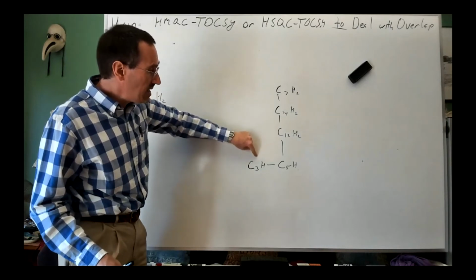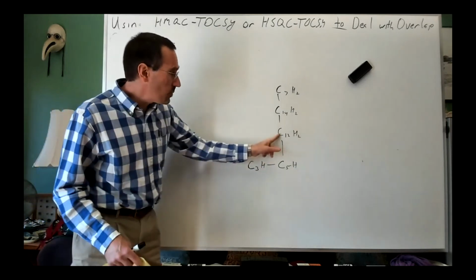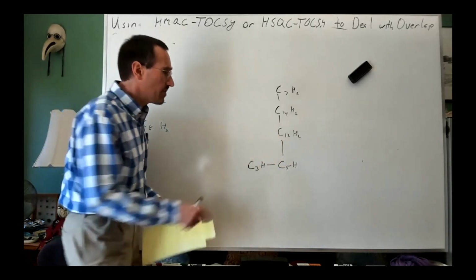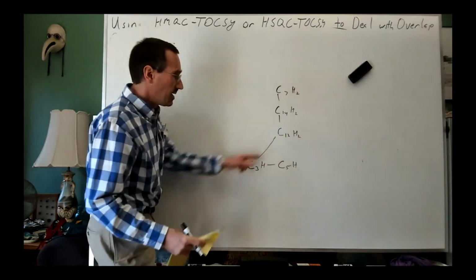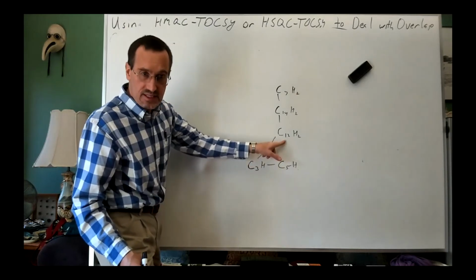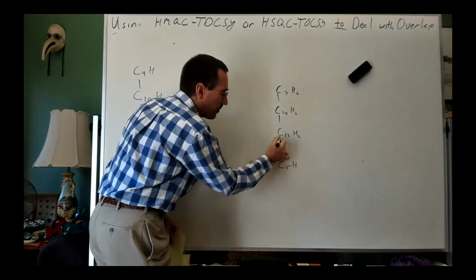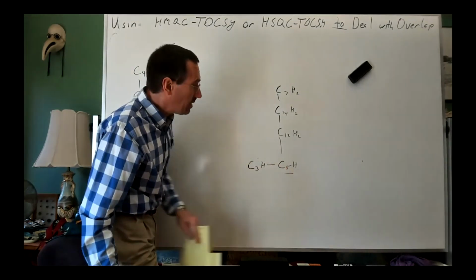It could conceivably have done that, but you'll notice this one came up second, and there'd be no way at that point, if we used our valence here, so imagine we had done that, there'd be no way to then connect C5 to C12. So basically, because the first thing that came up was C5, it was pretty clear to me.